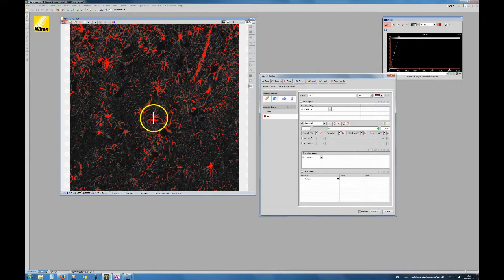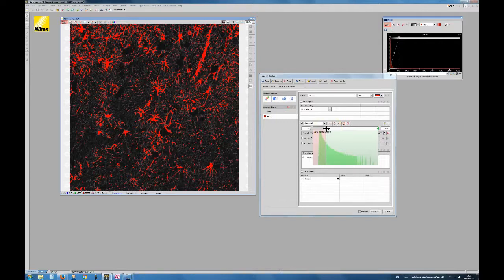So my mask is over all the pixels that have this intensity above 200, or here 167. Okay, we're making here a biased decision. This is something very important to understand: the segmentation always has the input of the user. But you're making the biased decision over the whole image. So it is still a good method.